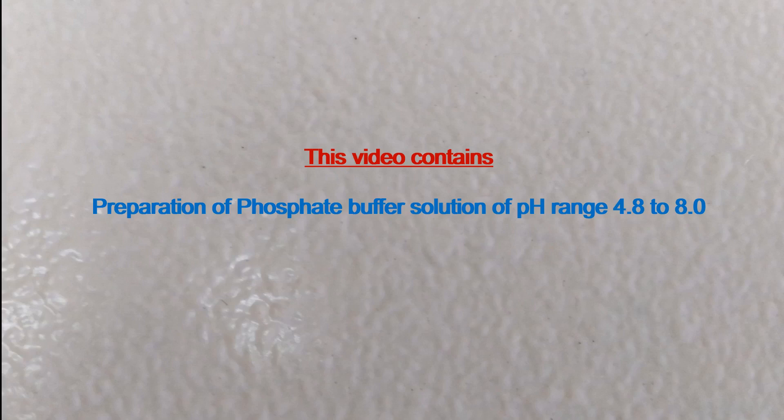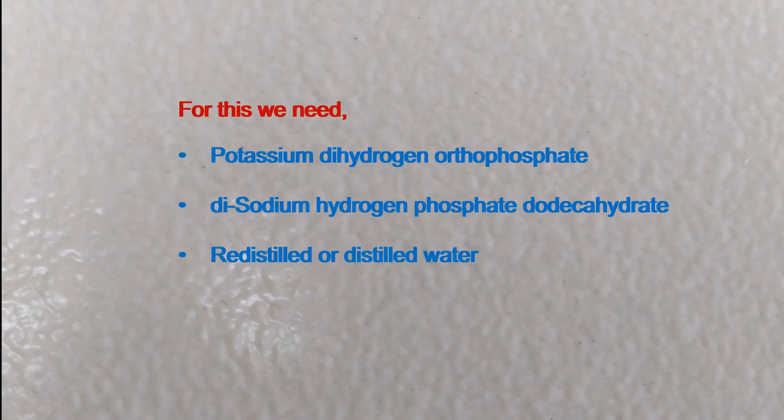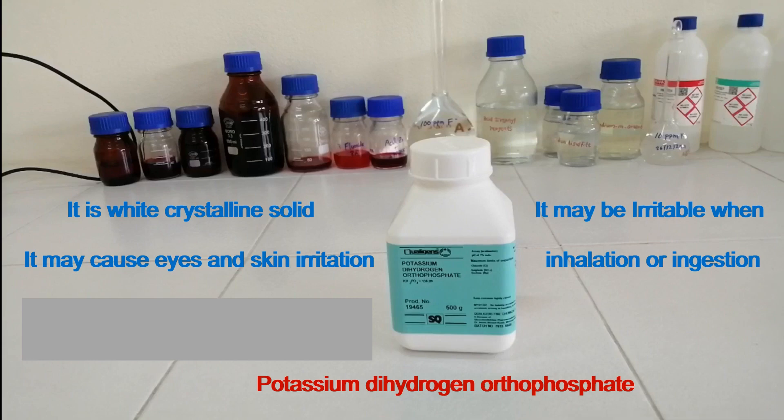This video contains preparation of phosphate buffer solution of pH range 4.8 to 8.0. For this we need potassium dihydrogen orthophosphate, disodium hydrogen phosphate dodecahydrate, and redistilled or distilled water. Potassium dihydrogen orthophosphate is a white crystalline solid.